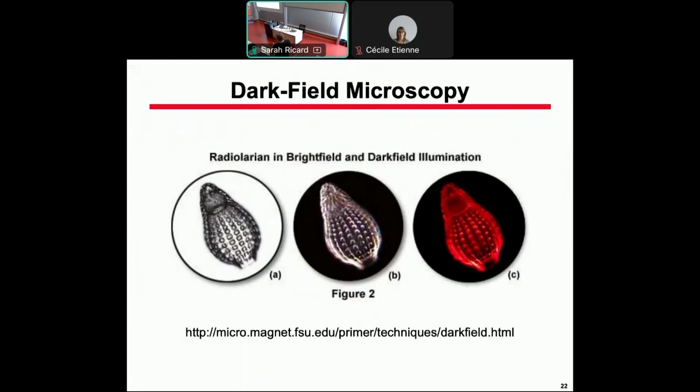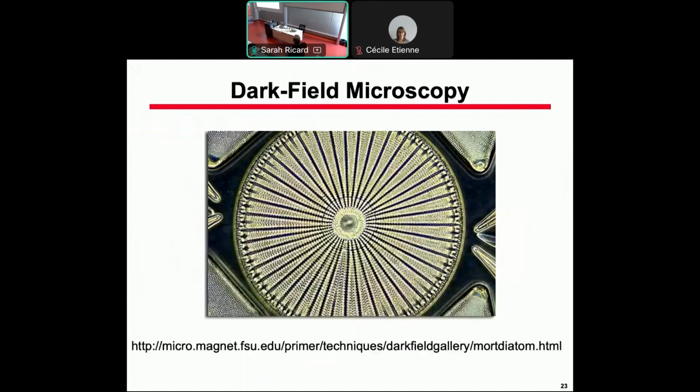The problem is obviously, what is the real image of this? In fact, we have the same sample, three different illuminations, three different images. So even if one has to simply draw shapes, it's not very clear. It's very easy to recognize a dark field microscopy image whenever you have an image where it's black where there is no sample, and light where there is a sample.